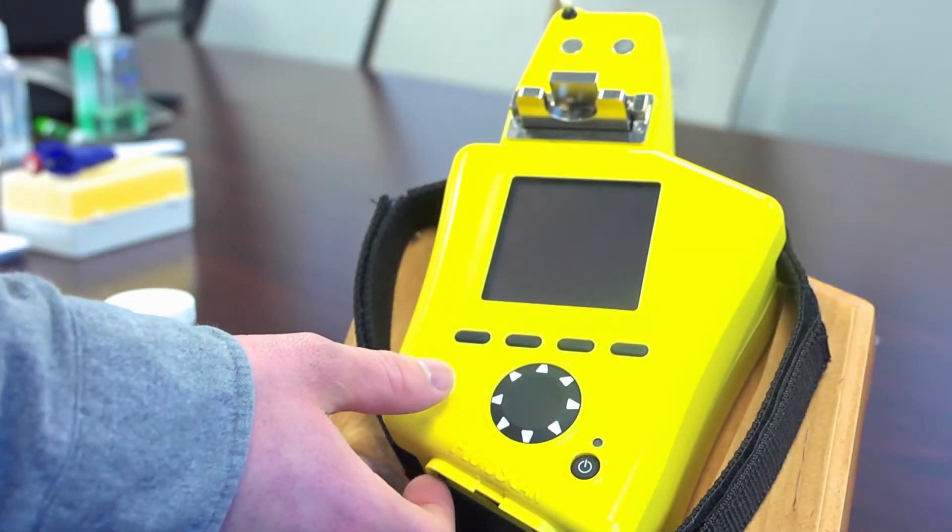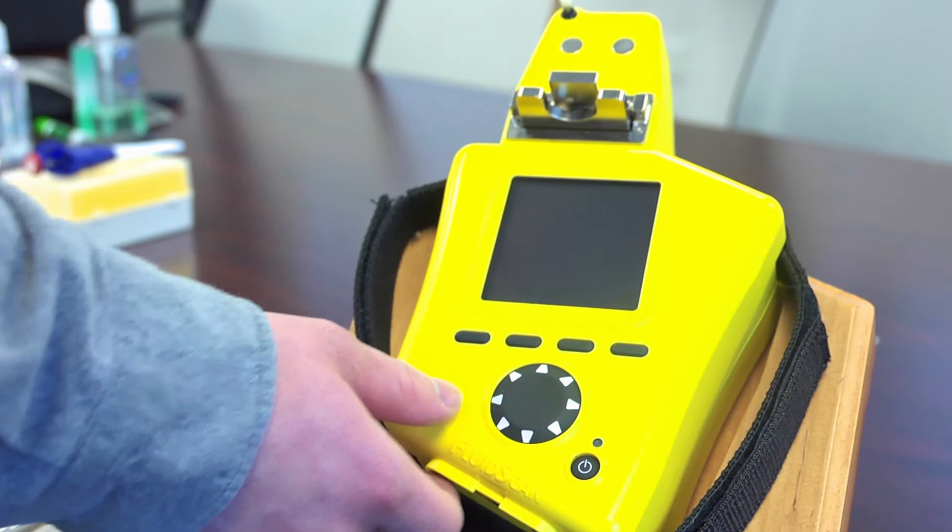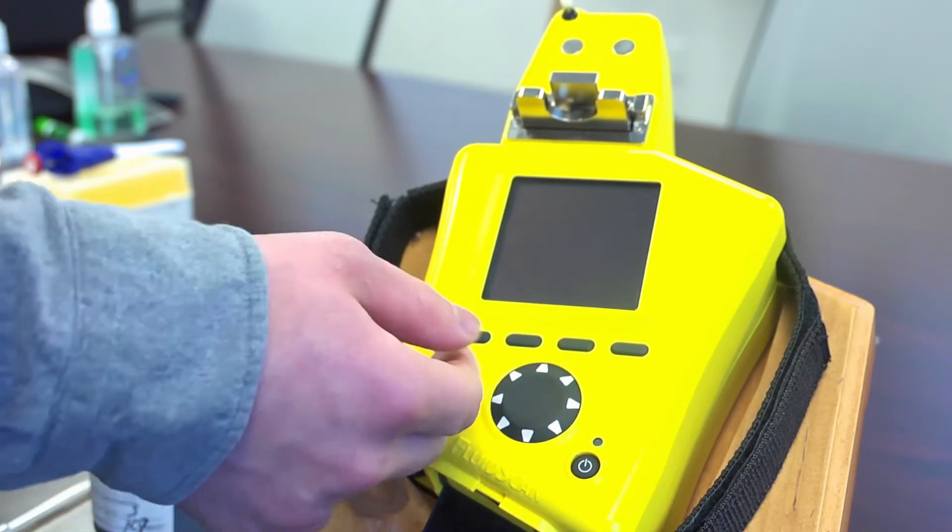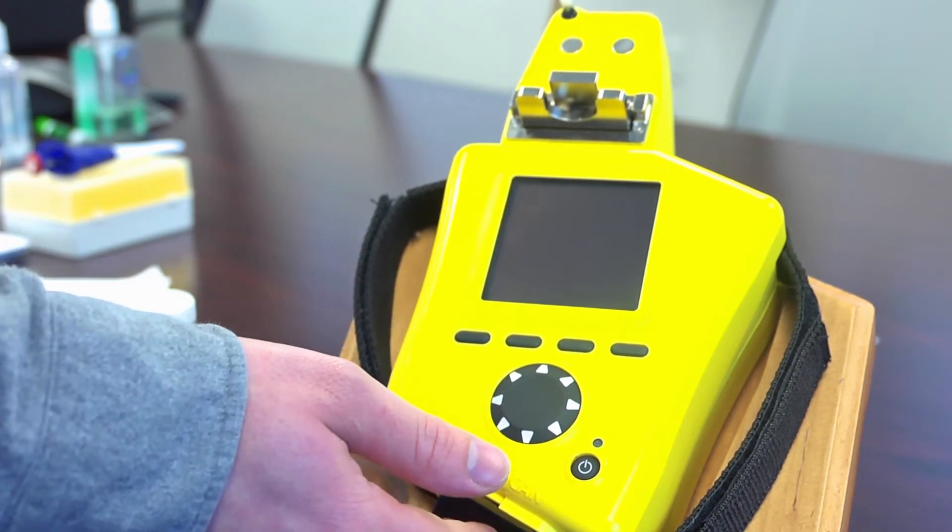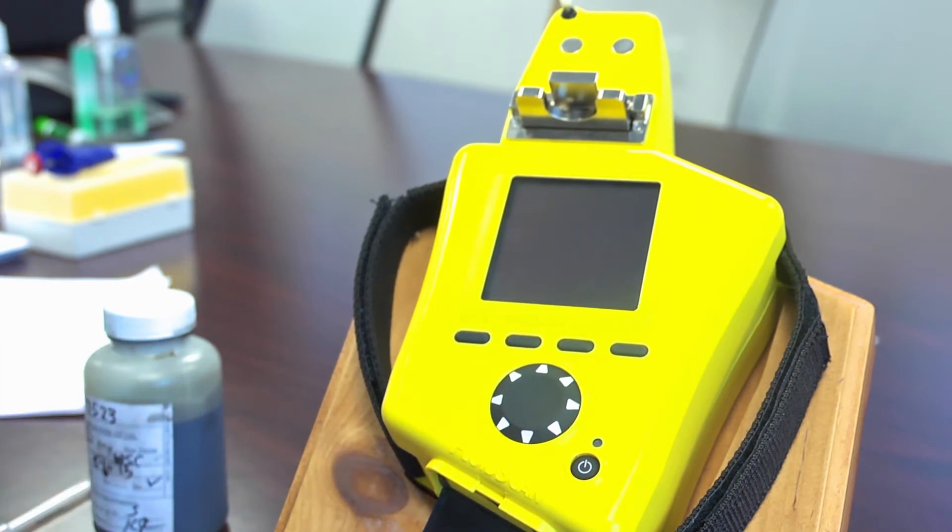Today we'll be discussing the FluidScan Q1000 Q1100. This is a portable unit that does not require any kind of solvent or large amount of consumables.